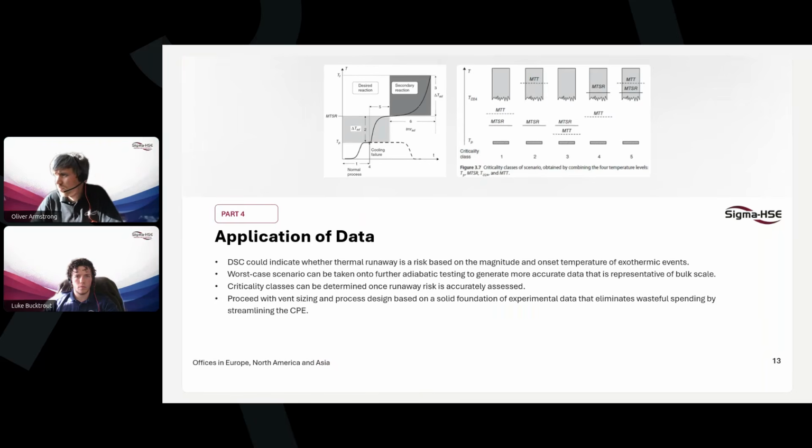So just to walk through that a little bit, we have some plots and graphs at the top, which are typical demonstrations of runaway reactions or their assessments in process safety and chemical reaction hazards. So we talk about adiabatic temperature rise and calculating that from DSC data.